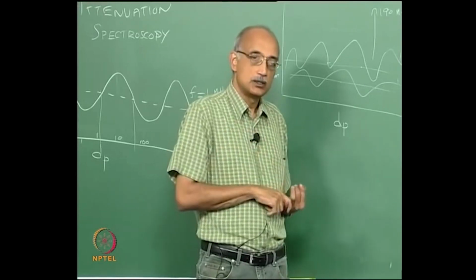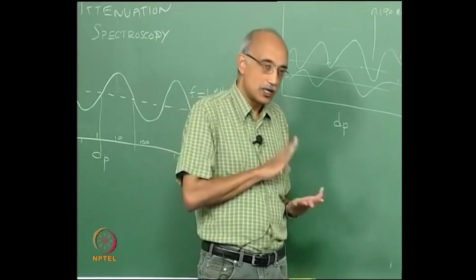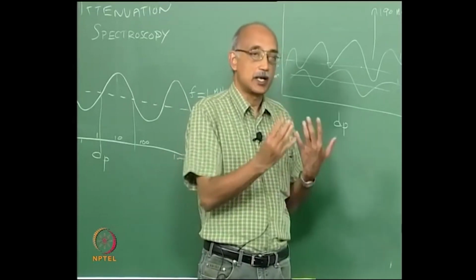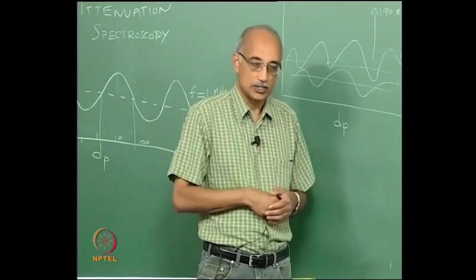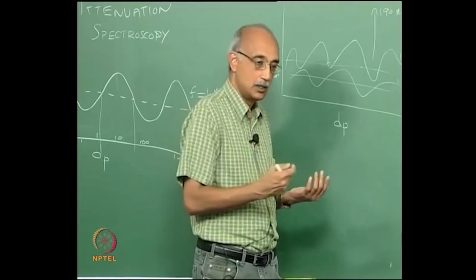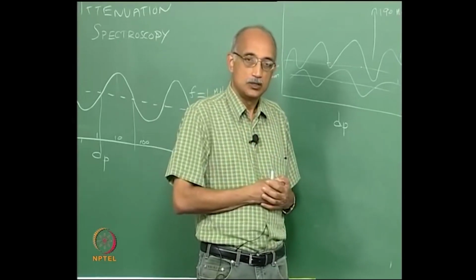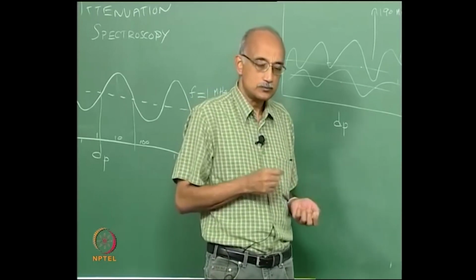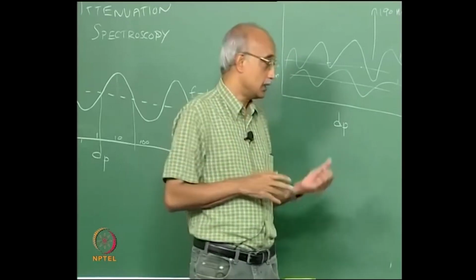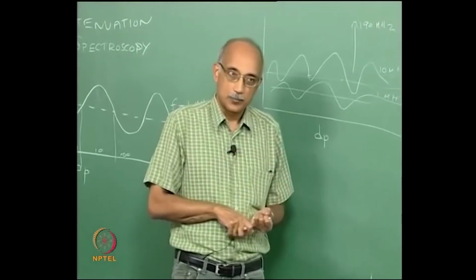In other words, by using conservation equations of mass, momentum, heat, by using constitutive relations such as the equation of state, and by looking at the fluid mechanical properties, constitutive relationships such as stress versus strain relationship, and by using the wave equation that describes how a wave interacts with the media, you can actually predict, for a hypothetical particle size distribution, how these attenuation spectra are going to look. So that is step number one.